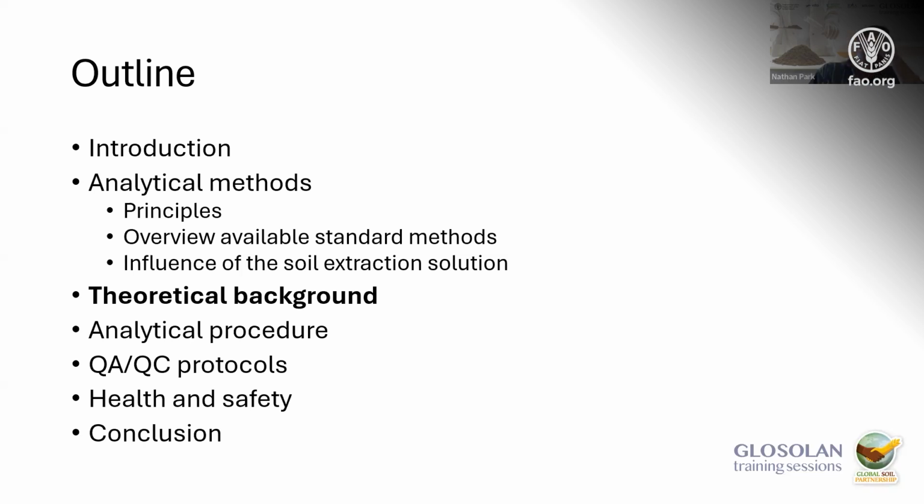I imagine, depending on the soil texture and density, there can be quite a bit different mass per sample. Yeah, and that can have an impact on the dilution ratio, but it has limited impact. I think the differences are 0.1, 0.2. It's not quite that much impact on the final pH results.